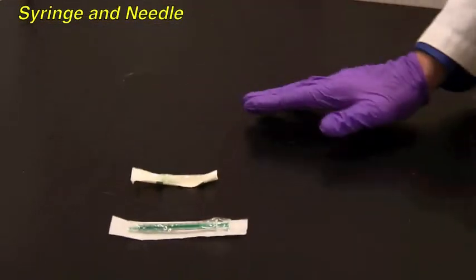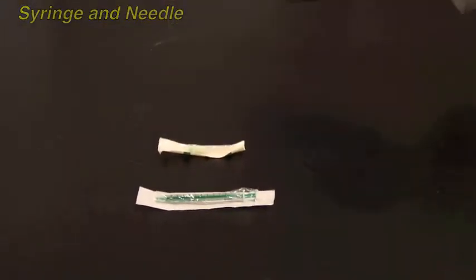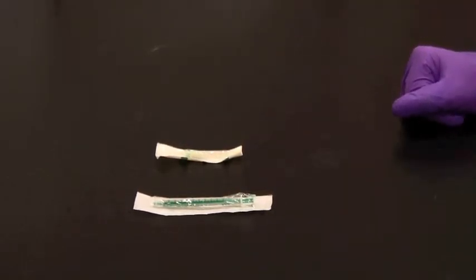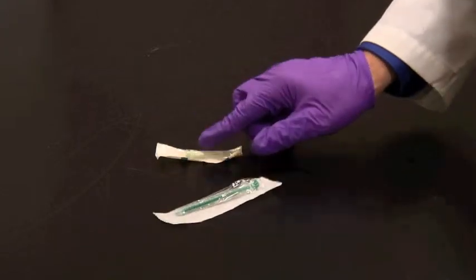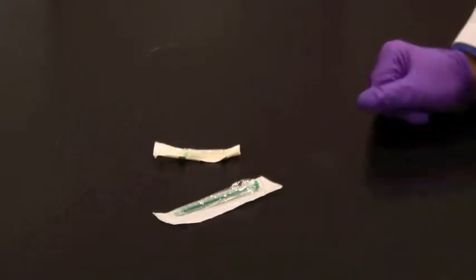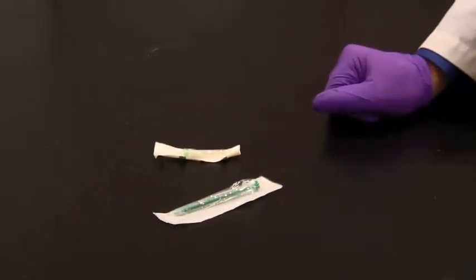Another part of anhydrous technique is being careful how you introduce your chemicals to the setup. You're going to be using a syringe and a needle, which will exclude air to introduce ether and solution into your setup.